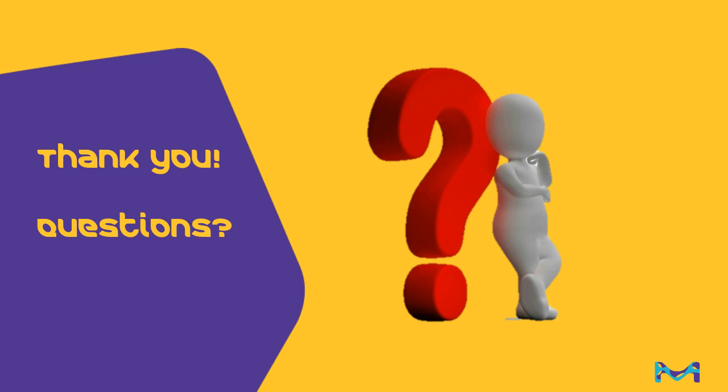All right, well, I'm going to throw the next question to Sasha. Sasha, welcome. The question for you is, for data acquisition, is it possible to acquire data using switching mode, positive and negative mode simultaneously? Is MSMLS Discovery able to handle this type of data?